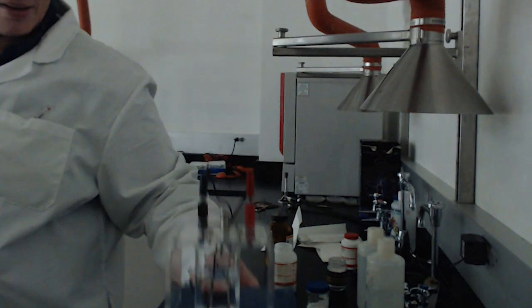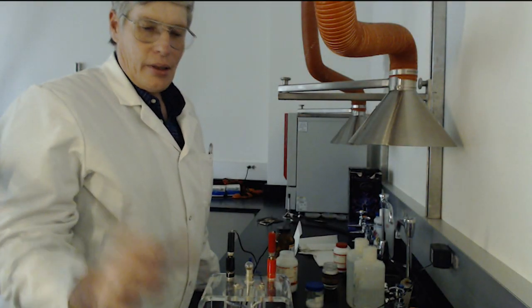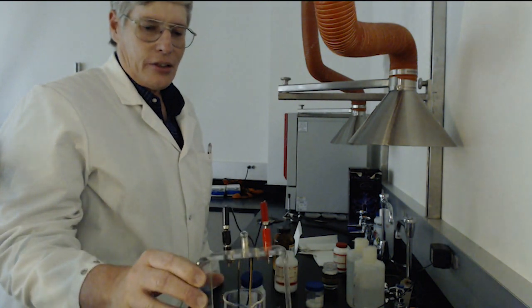Well, they're going to have to believe us. It's a very faint glow. It's like you can make out the filament and that's about it. So what does that tell you about acetic acid? Well, acetic acid dissolves completely in water, but hardly dissociates at all.